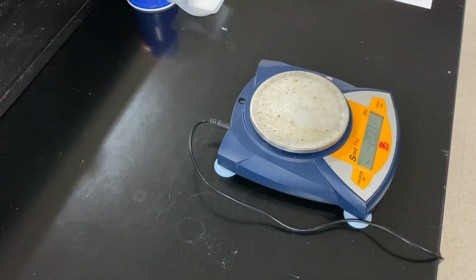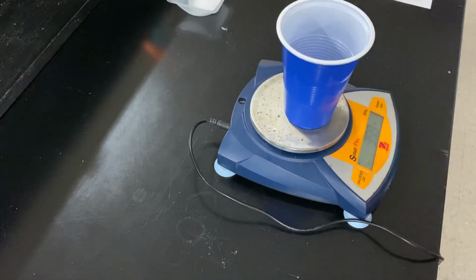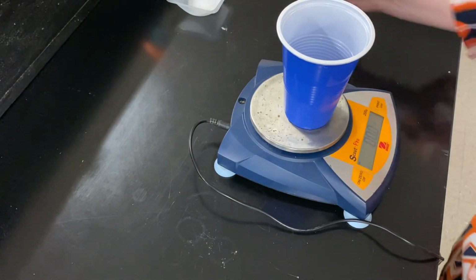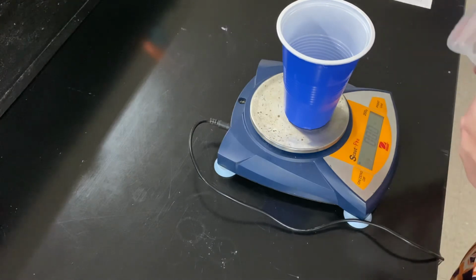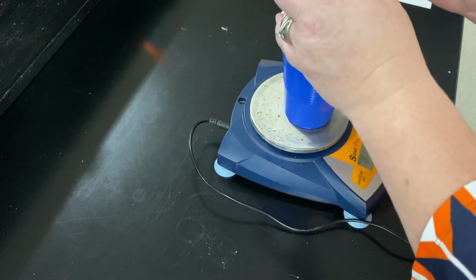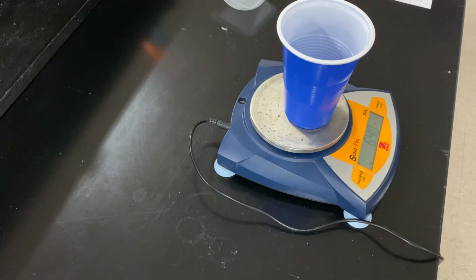The last task is to determine the number of moles in a sample of ammonium sulfate. So I'm going to take my blue cup. I'm going to zero it out. And now I'm going to add my sample of ammonium sulfate. This particular sample has a mass of 6.40 grams. 6.40 grams of ammonium sulfate.